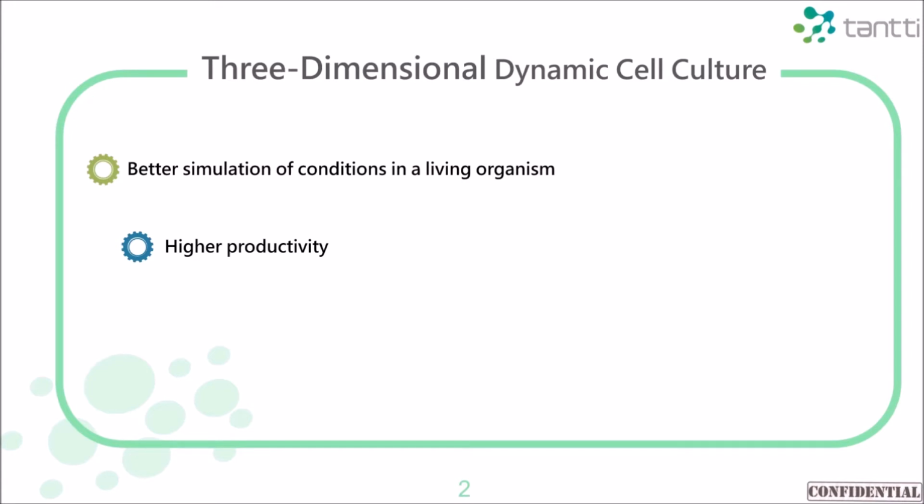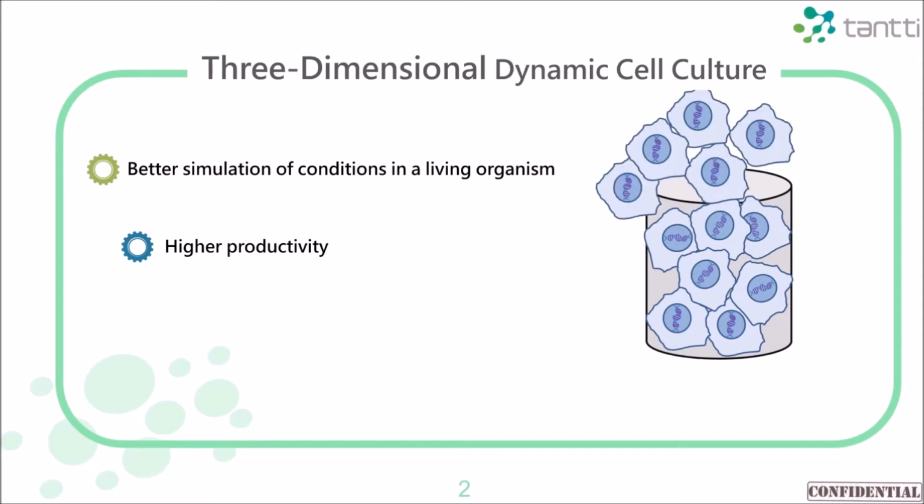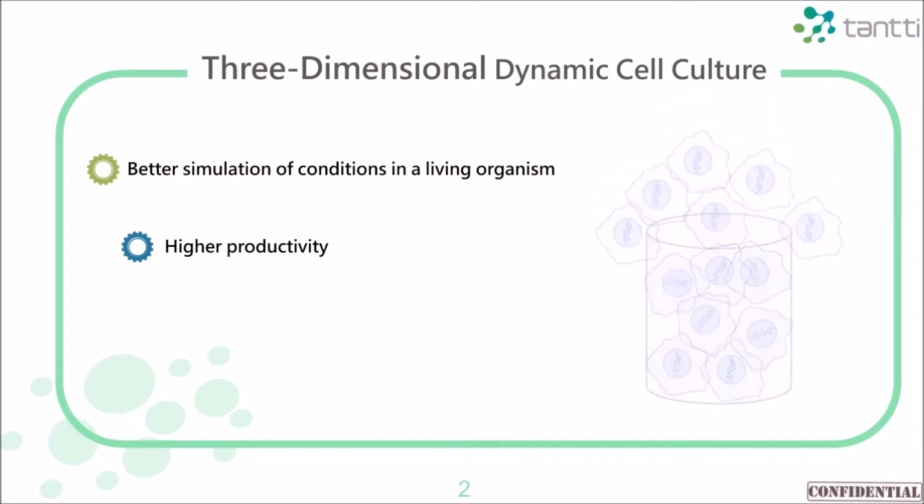Secondly, 3D culture for cell expansion is more productive than 2D culture. 3D dynamic culture can enhance cell aggregation and promote oxygen and nutrient exchange efficiency. One bioreactor can replace the waste of many 2D culture vessels while reaching the required cell yield.